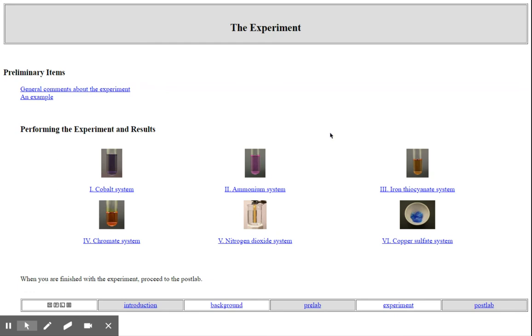There is one post-lab question, a 2-parter, to explain what happens with carbon monoxide poisoning and your hemoglobin. It's on the last slide there. So all you're doing in this lab is your data table where you're explaining what 3 stresses you did, what your observations were, the color change, precipitate, whatever happened there, and why those 3 changes happened. So the example is already written for you.